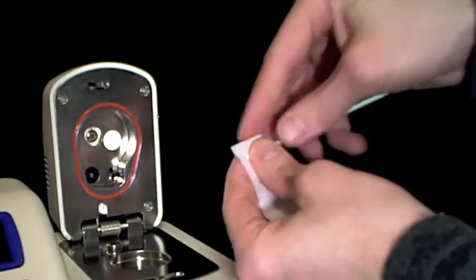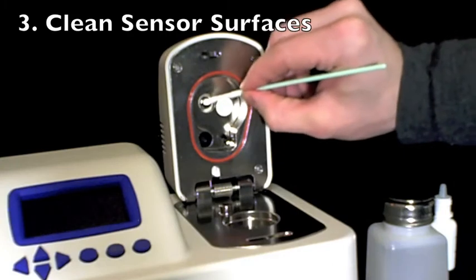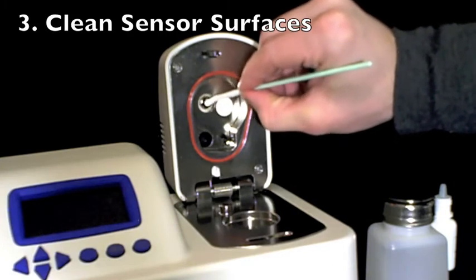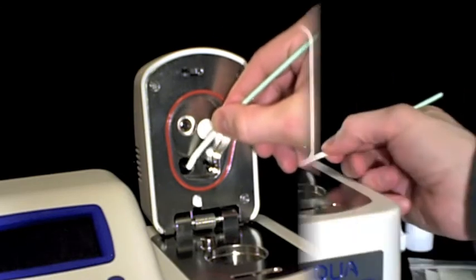In the next step, we use the same technique to clean the surfaces of the sensors within the sensor block. First, take a clean kimwipe, apply cleaning solution, and clean the thermopile, the mirror, and the optical sensor.